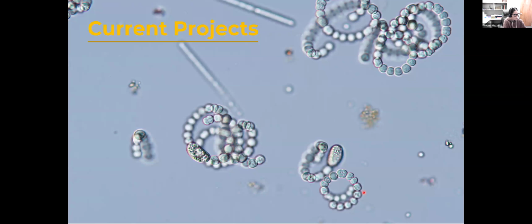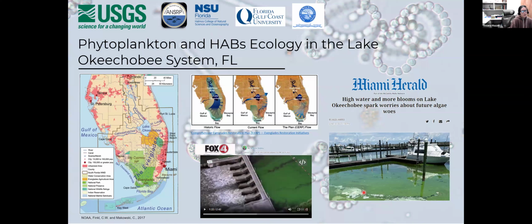So I'm going to just go over some of the current projects we have going on in the lab. I'll start off with our Lake Okeechobee phytoplankton and HABs ecology study.